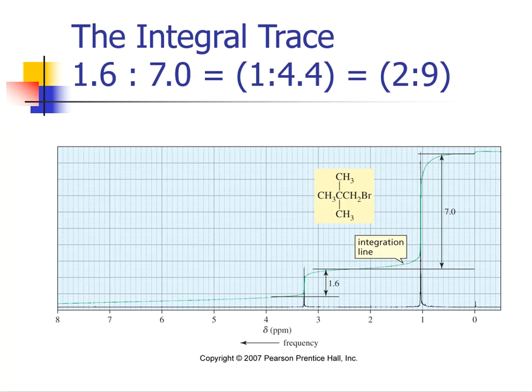I can't really zoom in and take a look at the footprint of each one of those spikes or those chemical shifts, but I know that we can integrate it. And the computer system will integrate it for us. And it will just give us these random little numbers, okay?